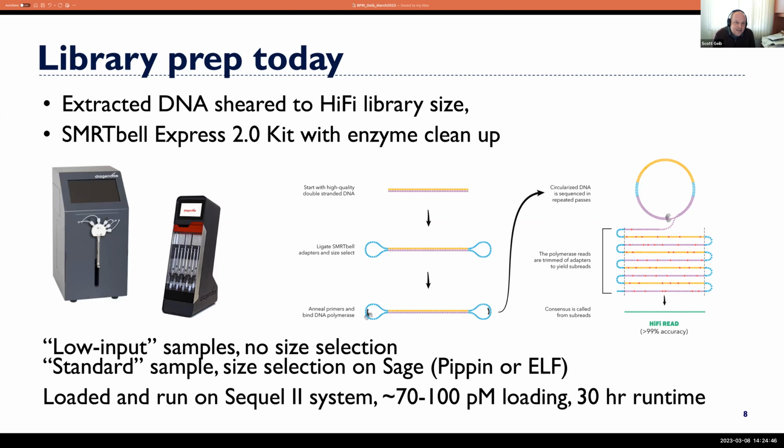The 8M cell has 8 million little holes that the DNA can go into. If you have a lot of short stuff, the short stuff is going to go in the little holes before the long stuff. So at the very end of library prep, they do have a size selection method that uses AMPure beads. It's a permissive AMPure that cuts off the DNA around 5 kb, so you can remove those 5 kb fragments. But if you have something sheared from 3 kb up to 40 kb and it just looks like garbage on the Pippin, I would probably say there's something wrong with that sample.